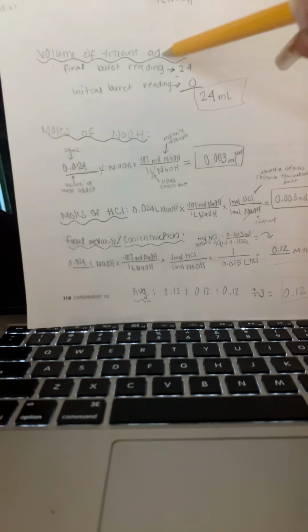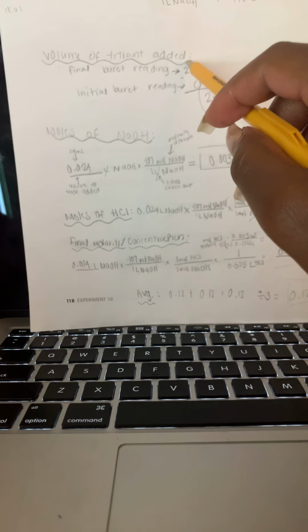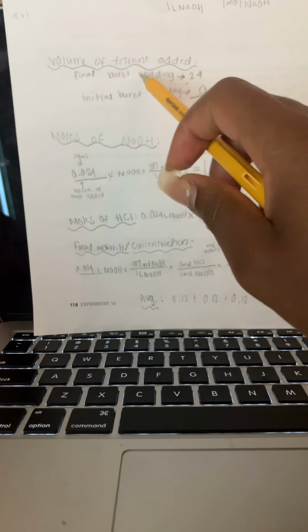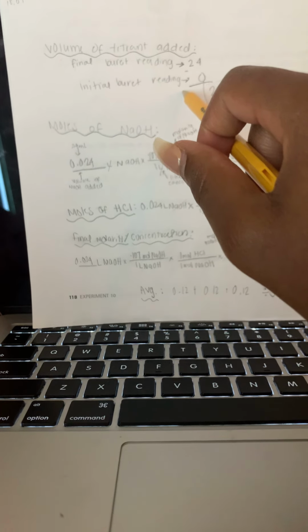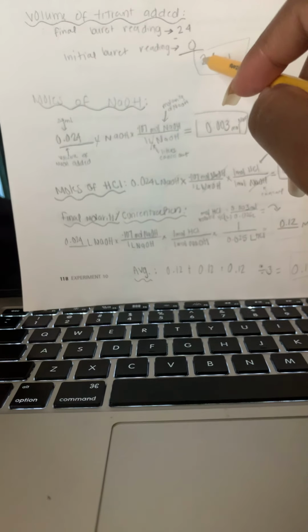Okay, so I'm going to show you how to calculate the volume of the titrant added. To get the answer, we're going to take the final burette reading, which is 24 milliliters, minus the initial burette reading, which was 0 because it started at 0. And that gave us 24 milliliters.